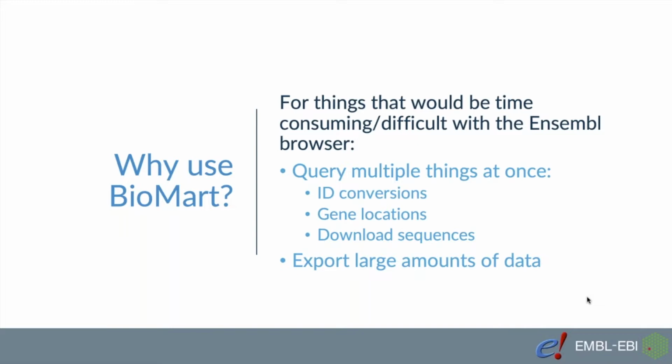However, BioMart has its own limits as well. It's not designed as a whole genome download tool. If you wanted whole genome sequence, please go to our FTP site. When it comes to BioMart search, we recommend around 500 entries at a time.